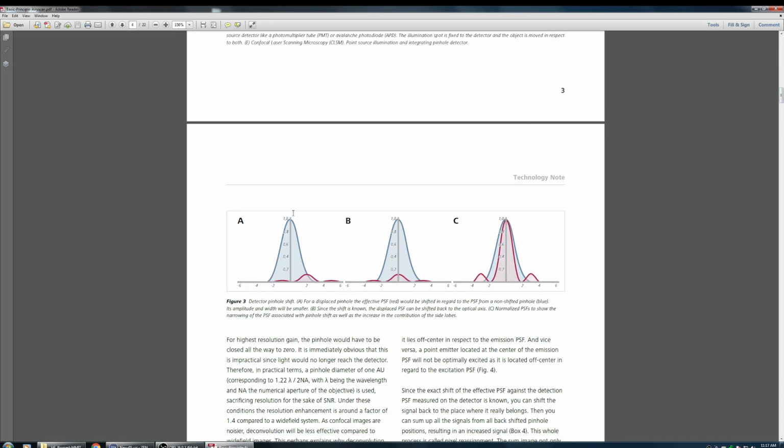This figure shows the blue is a normal confocal, which has around 240 nanometer resolution. Then all these small signals from the Airyscan can be combined to a better resolved image.